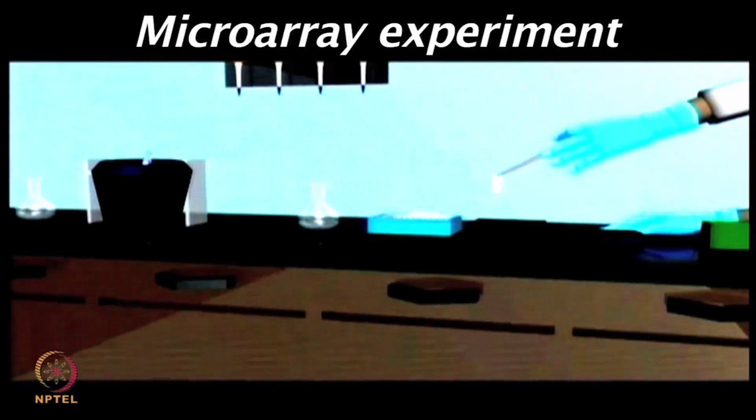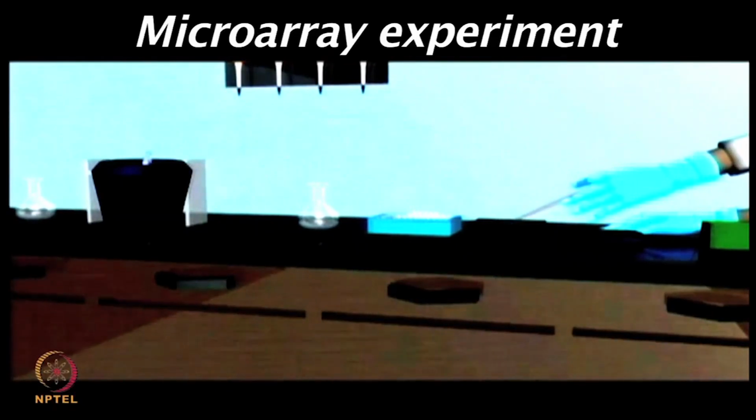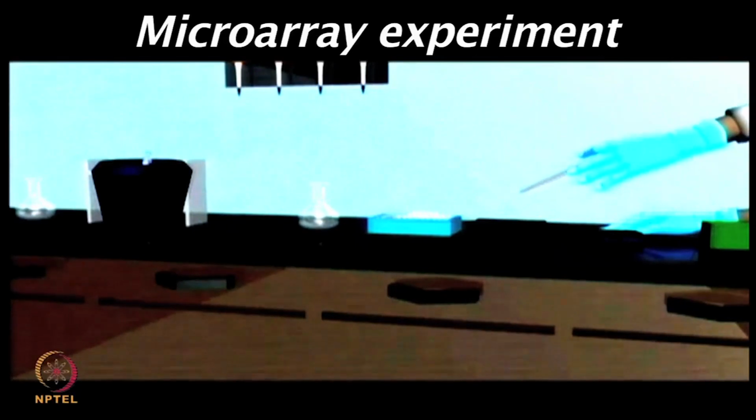If your washing steps are not very meticulous in the microarray experiment, at the end you will see very high background and you will see many non-specific bindings, which will interfere with the signal detection.